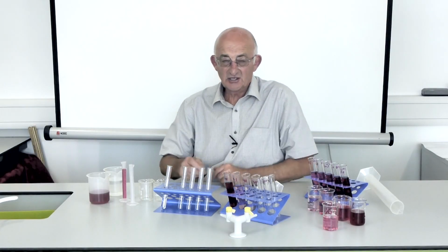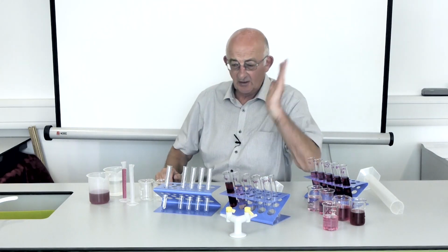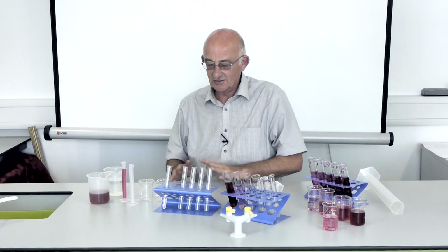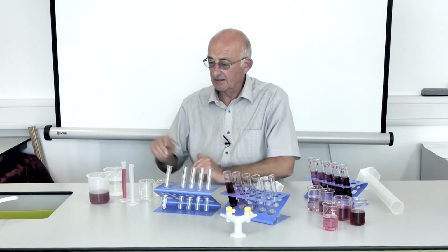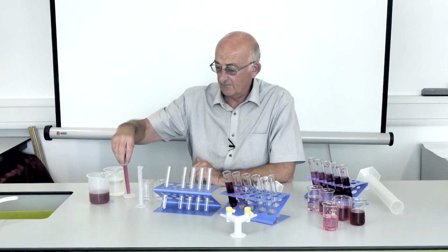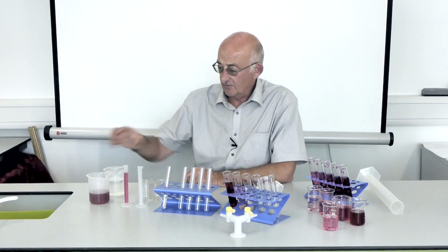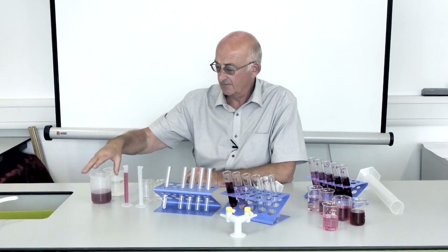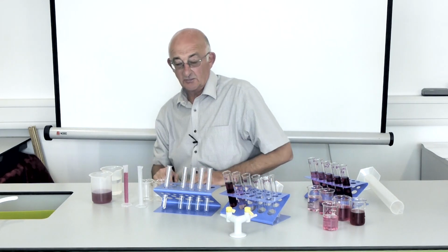This is one variation on the theme of how you might make up solutions that are diluted by a factor of 10. It works a lot easier in terms of students being at ease with the difficult numbers of 1 and 10 if you actually use 10 mil, 10 centimetre cubed. So we've got our stock solution, and I've very carefully poured in 10 mil of my stock solution, and I know that's my starting point.